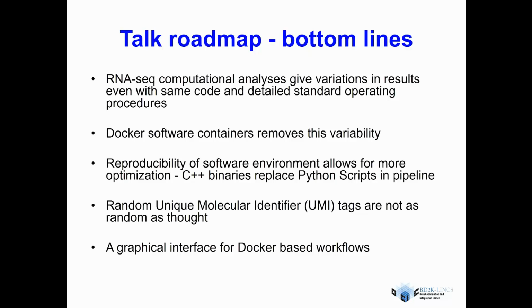And this does actually improve the speed by about twofold at the end of the day. But more importantly, the idea is that if we can get workflows to be reproducible and easily disseminated, people might do things like stress test our existing protocols. You might actually try to reproduce things if it's easily reproducible.